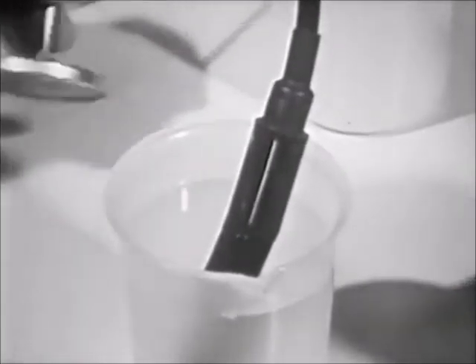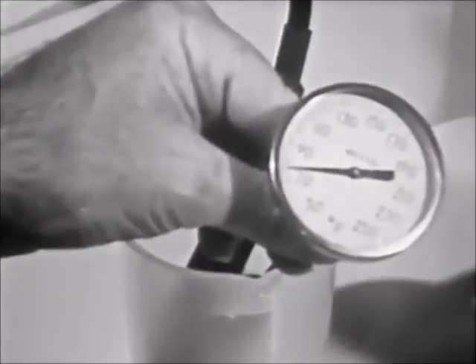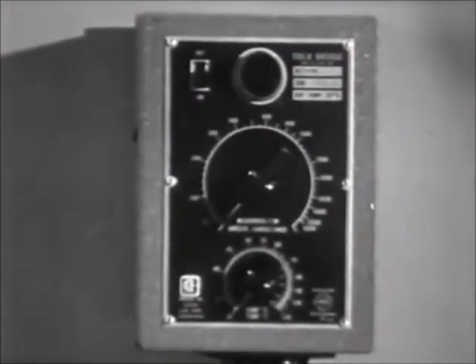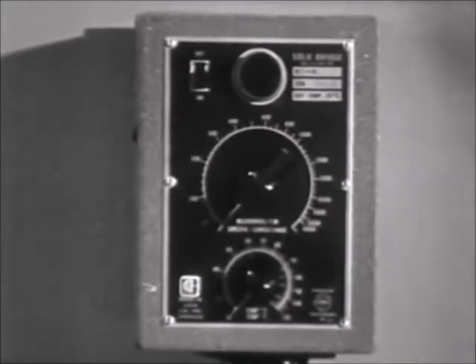Place the thermometer into the beaker, turn on the meter, and allow it to warm up. The tuning eye will glow when the meter is warm.